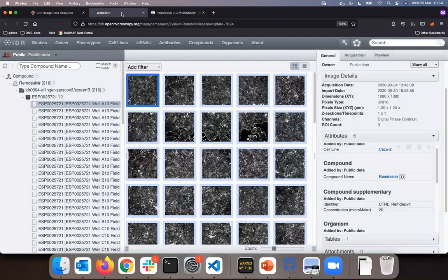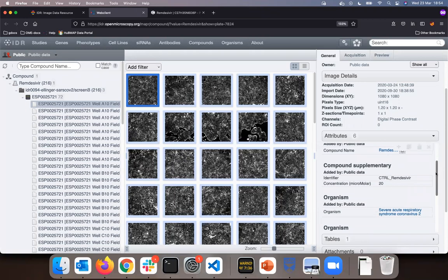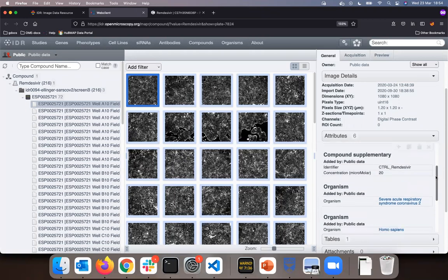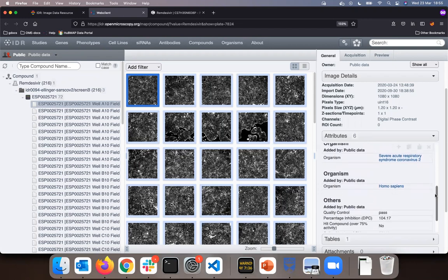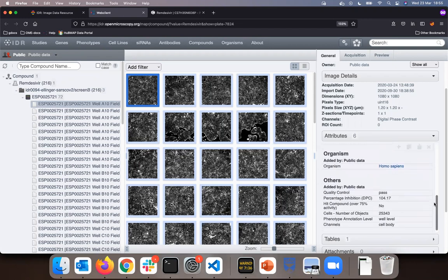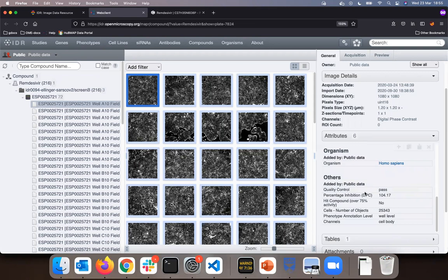I will go back to IDR and scroll in the attribute section of the metadata lower to the section others. This was also submitted by the authors of the paper and it shows the percentage inhibition DPC.